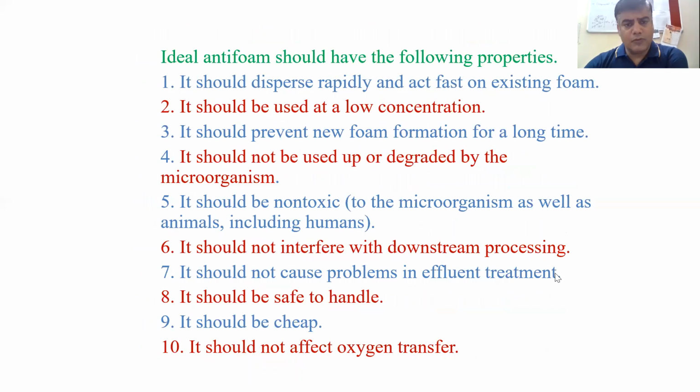So what should be the ideal antifoam? We have already discussed the characteristic properties of the antifoam in the different lectures. An antifoam should disperse rapidly and act fast on existing foam. It should be used at low concentration and prevent the formation of new foam.